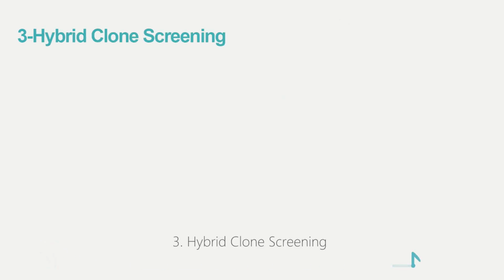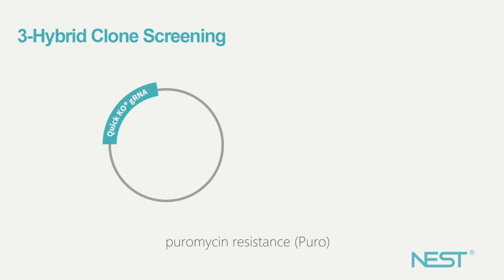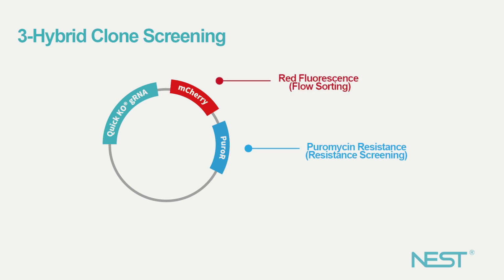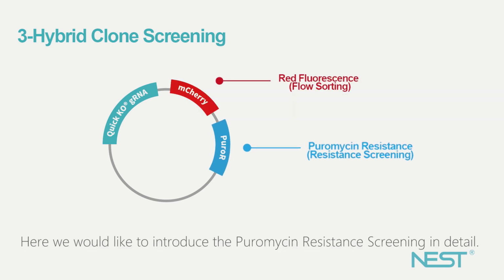Third, hybrid clone screening. QuickKO guide RNA vector possesses 2 screening labels: puromycin resistance and red fluorescence. Either resistance screening or flow sorting can be selected to concentrate transfected positive cells. Here we would like to introduce the puromycin resistance screening in detail.